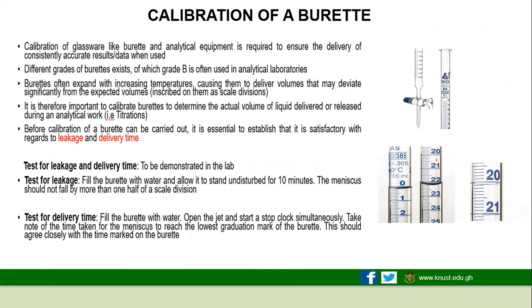Now, we do calibration to actually verify whether our equipment is working well, right? That is why we do calibration. Usually if you take your burette, it has values on it, but sometimes even with a change in temperature, there can be expansions, and then the volumes delivered might be different from the volume stated on the material. So it necessitates that before any experiment, we calibrate the burette. Let's go to the experiment.